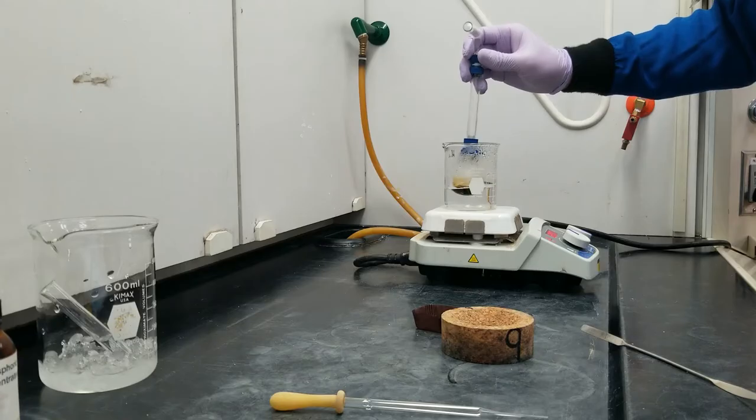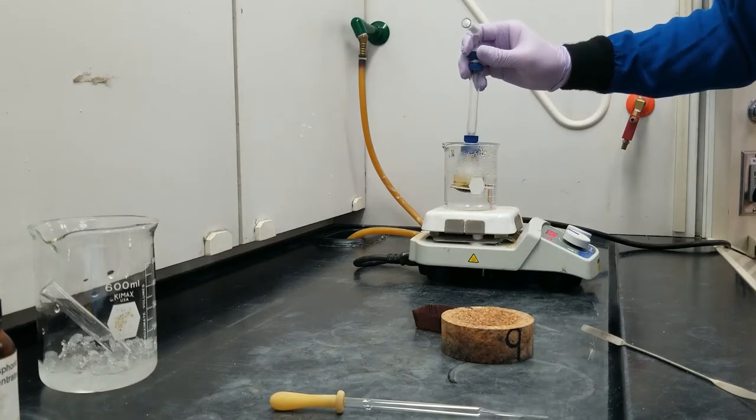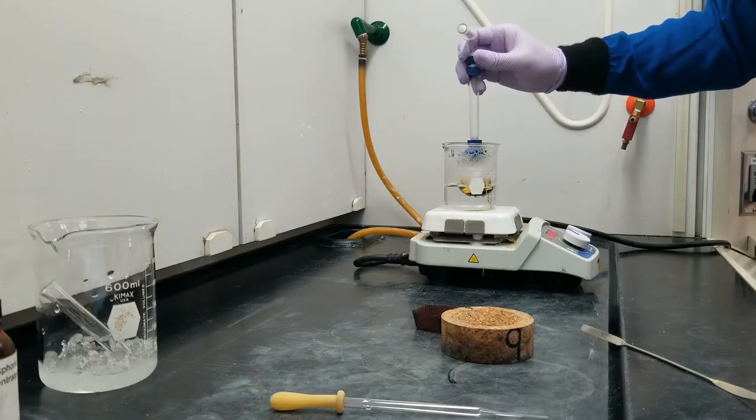The reason why we are only reacting for 3 minutes is that we are cutting the reaction short on purpose so that we have a mixture of ferrocene and acetyl ferrocene that we'll actually need to separate. By having a lot of ferrocene and a lot of acetyl ferrocene, it makes the column chromatography a lot more visually impactful. It makes the two compounds easier to separate from each other completely.